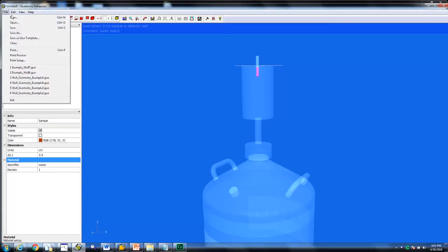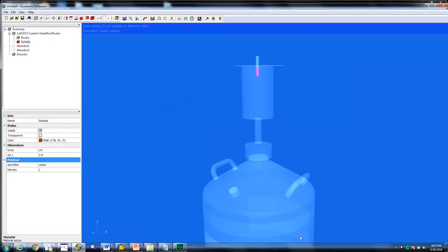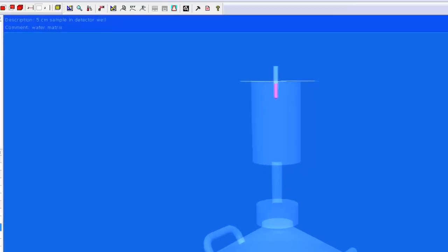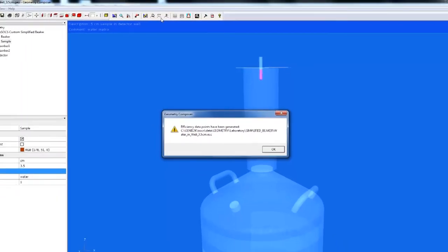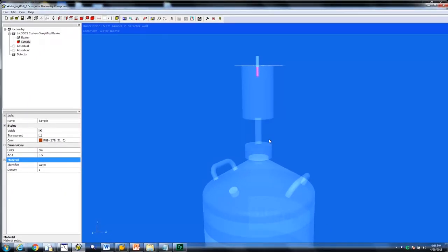Name the geometry file and save it. Complete the step by clicking on generate my efficiency curve. This generates a set of geometry efficiency data points, also known as an ECC file. Click OK to close the dialog window.